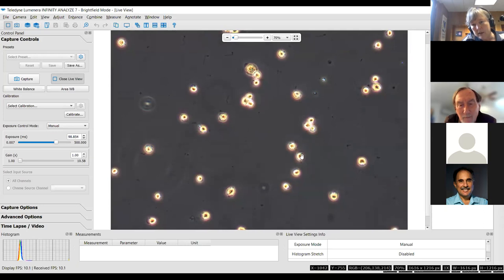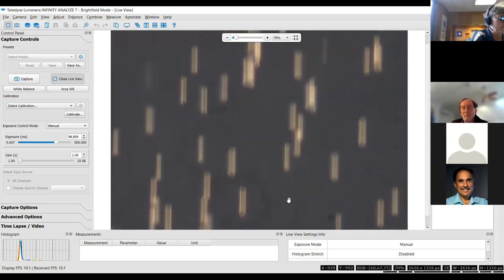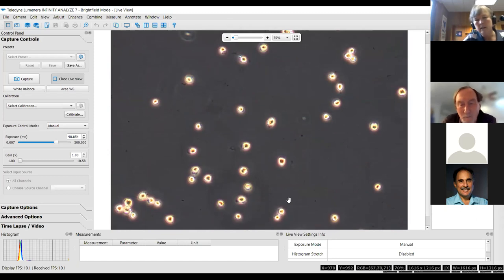And then the end that is actually inserted in the colony is this end. It's just like a little vacuole, and when the colony dissociates, it breaks. So you don't see much of the cell. This actually shows that, right there, that attachment where it's just kind of nebulous. That's where it's situated into the colony.